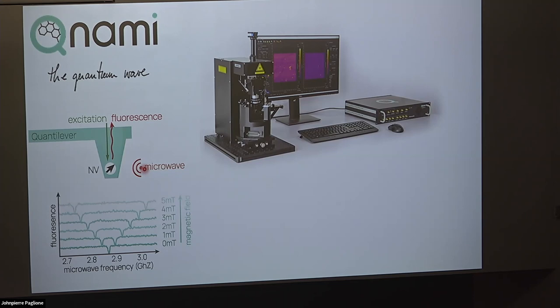Yeah, there's a lot of interest. And I will say the biggest interest, of course, is JP's question, temperature. That's what we're trying to get them most interested in, because that's the big variable. Most of our stuff, unfortunately, doesn't work very well at room temperature. Then what's the base temperature? Well, this one's just room temperature right now. They're working on a cryogenic version.